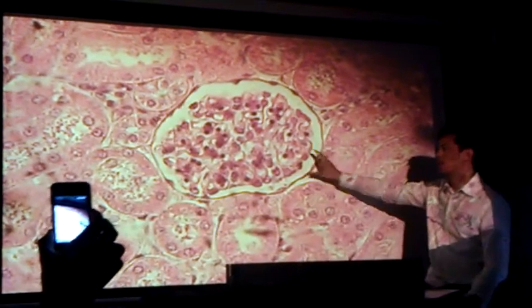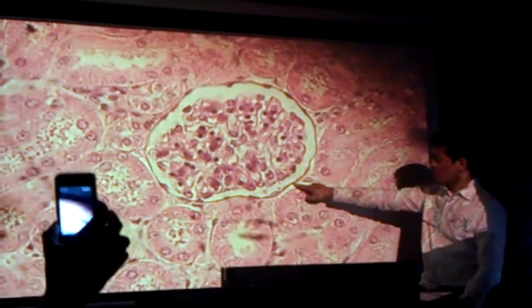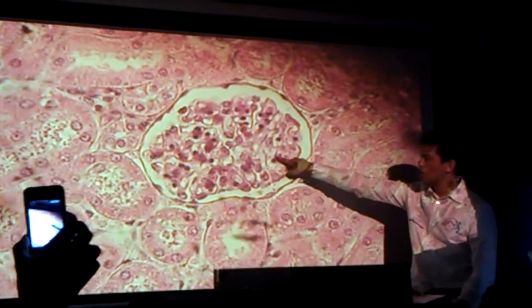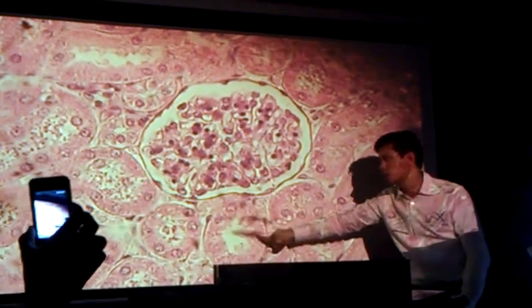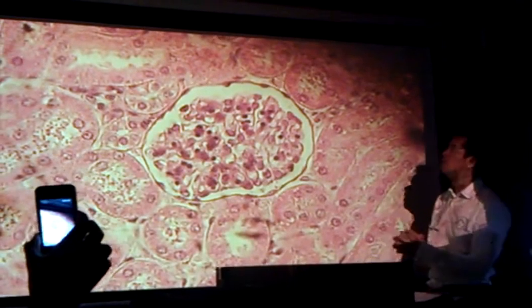This is actually Bowman's capsule. So outside is Bowman's capsule, then Bowman's space, then the glomerulus, and these structures out here are the proximal convoluted tubule.